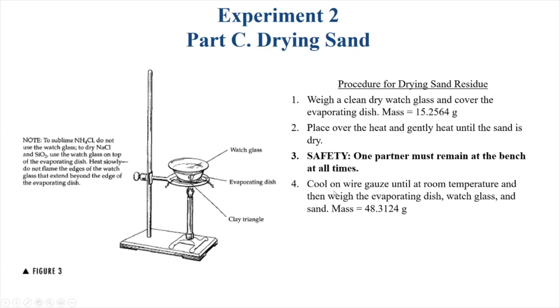So once the dish is fully dried, we're going to cool it on wire gauze until it comes down to room temperature, and then we're going to weigh the evaporating dish, watch glass, and sand and get a mass of 48.3124 grams.